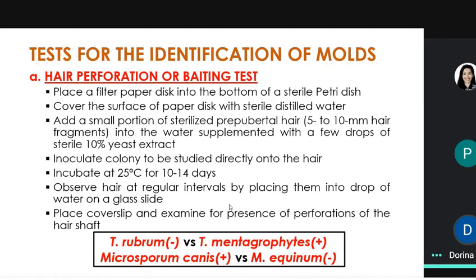The spiral hyphae was very obvious in the slide. Doon nanggaling yung kanyang macroconidia. Kasi di ba sabi natin, ang mga conidia saan manggagaling? Diba, doon sa mag-a-attach yan sa hyphae mo. Kaya nga, pag yan ay doon sa mga sporangium, you do not tell me hyphae, but you should label it the sporangiophore. Parang ganun.